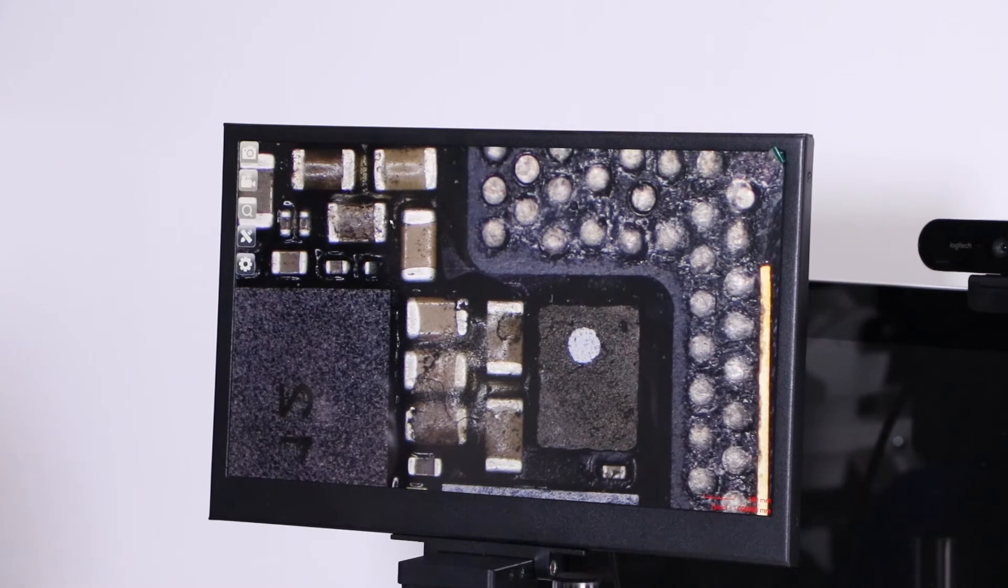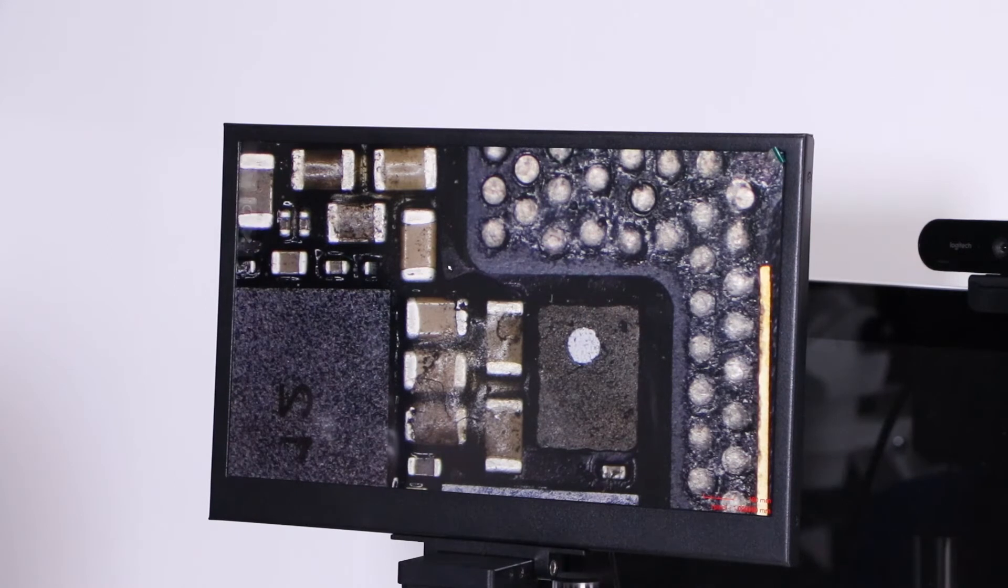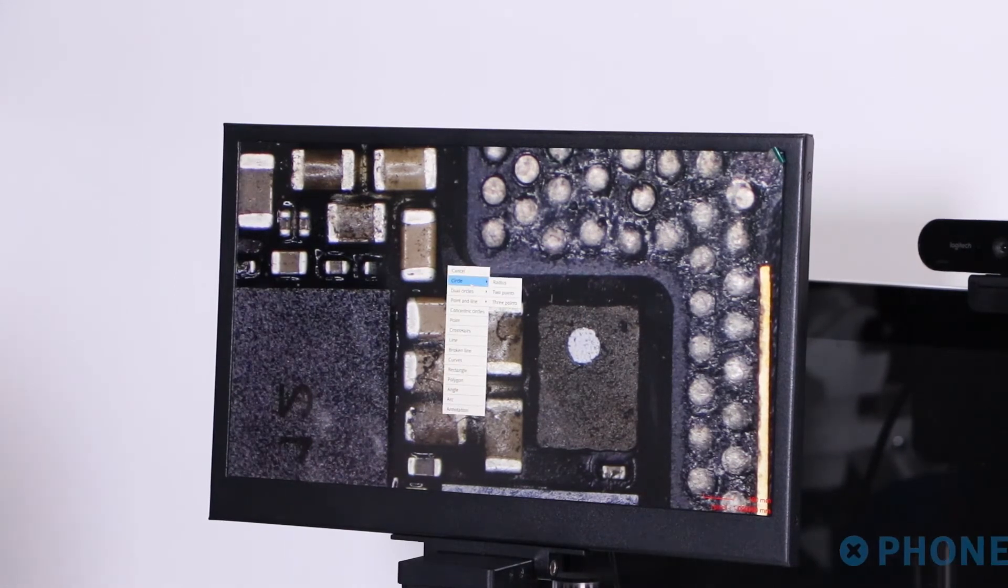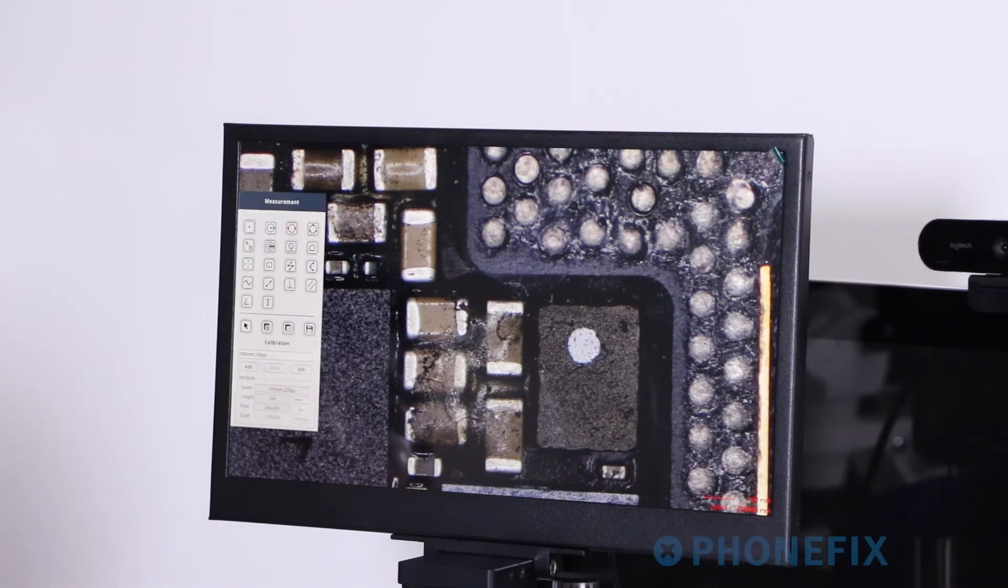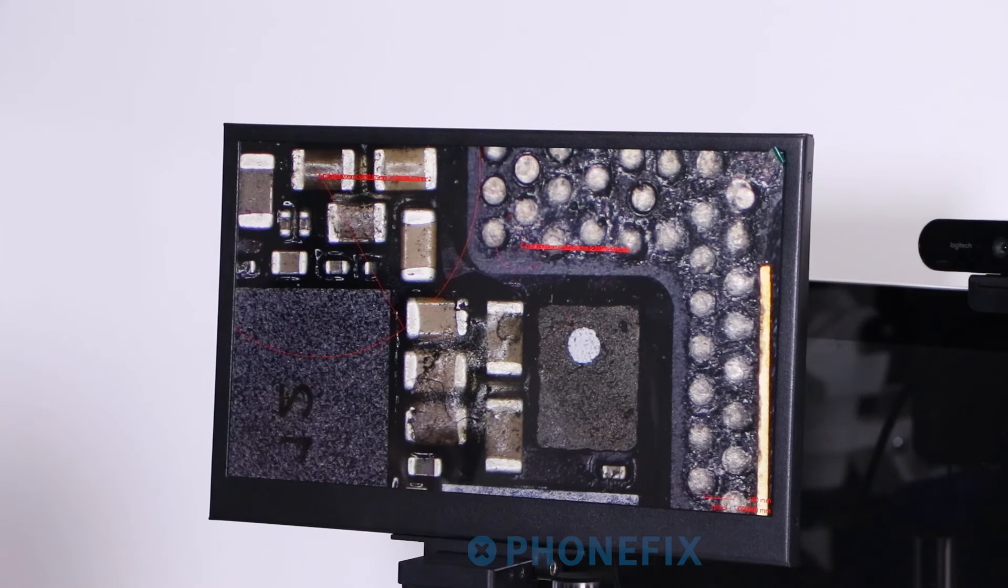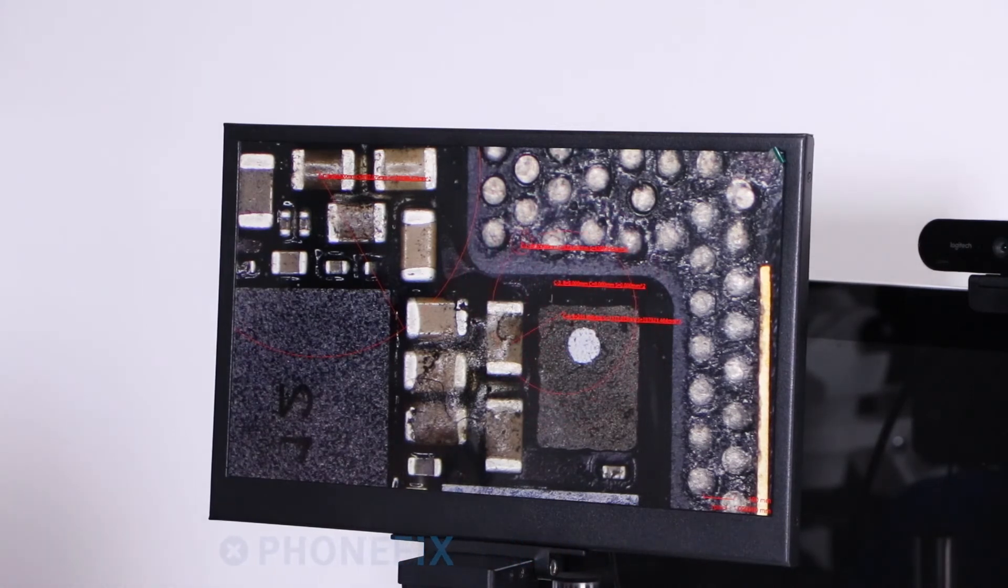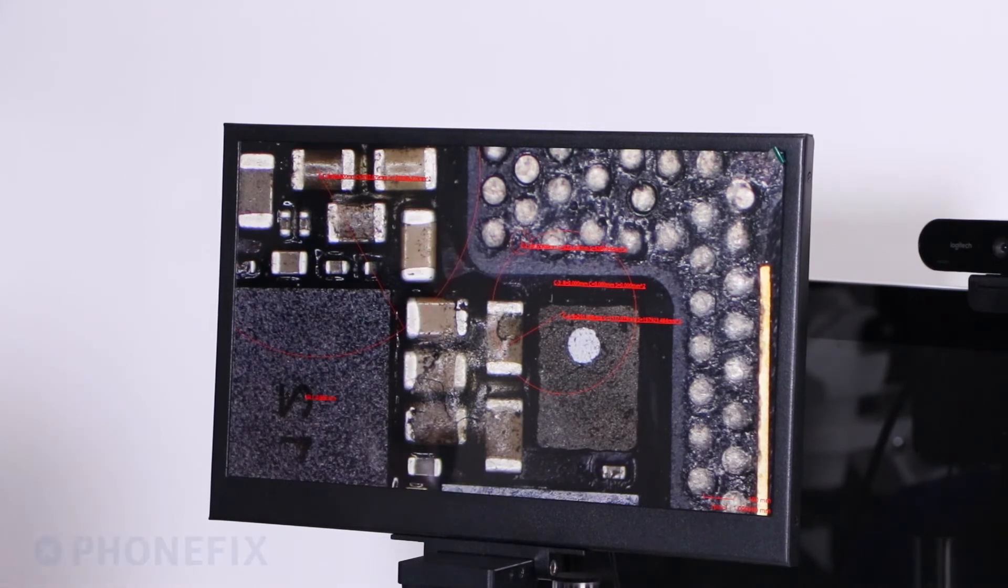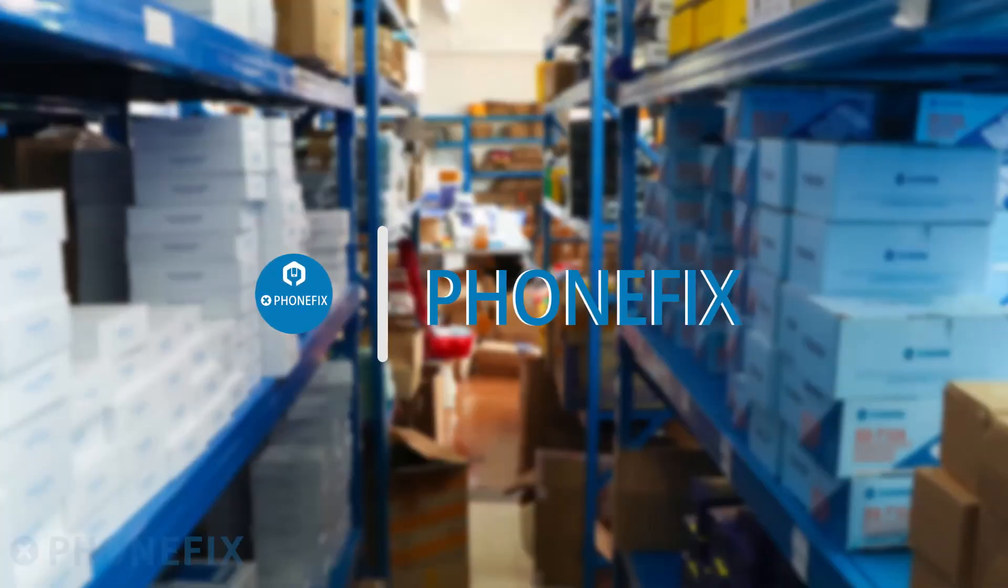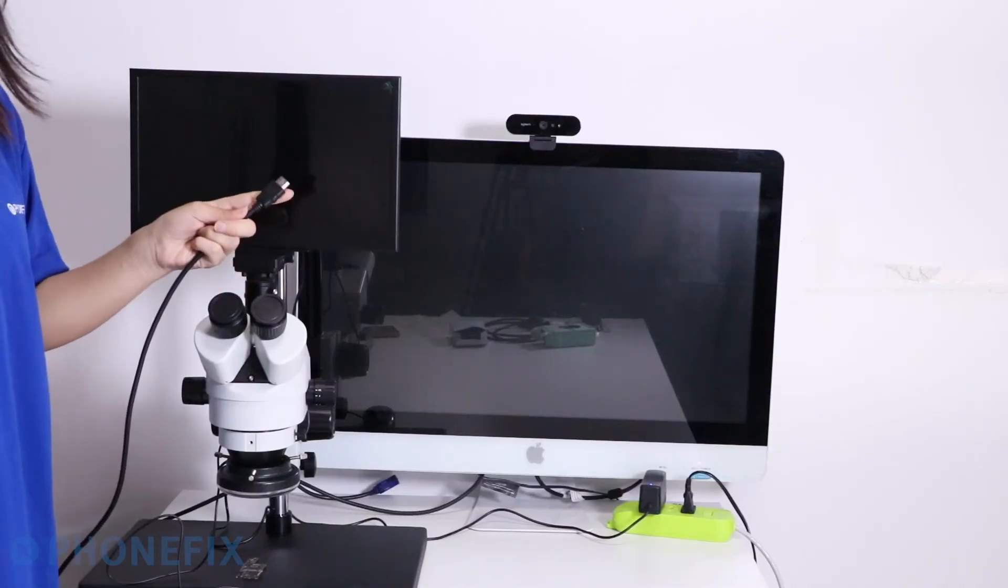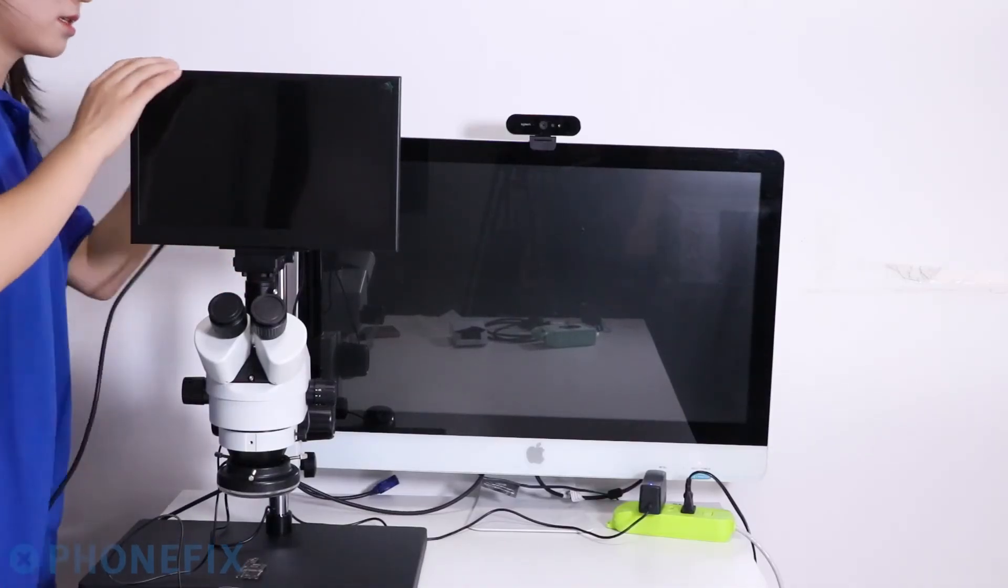You can take photos, record video, and adjust the crosshair. It can be connected to HDMI output.